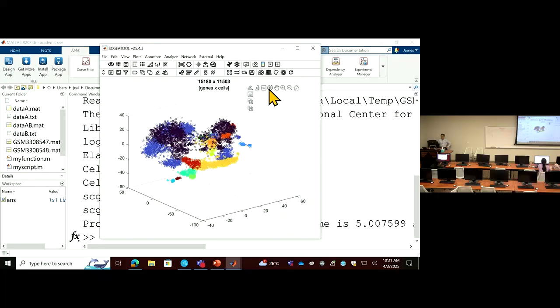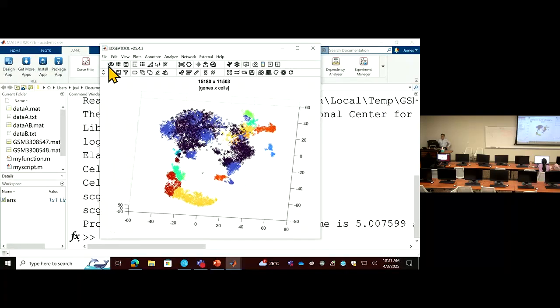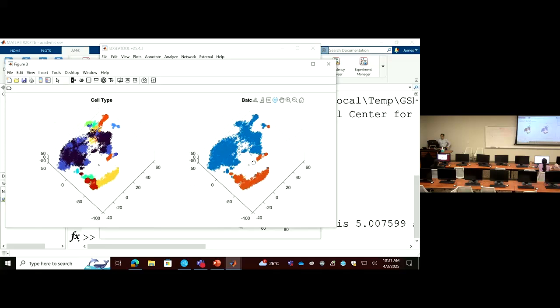So this is a more complicated sample. There's human data, more cell types in there. And we have to look at the groups. Okay, looks like we have this group compared to that. So this is 8-3. Is this correct? So intersites. Yeah, so I think in this analysis, we are going to compare intersites.